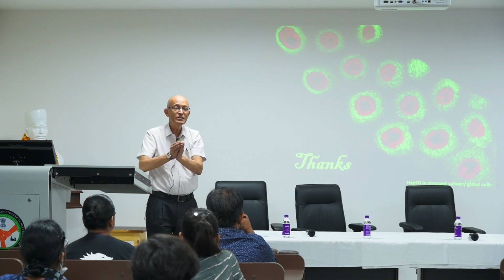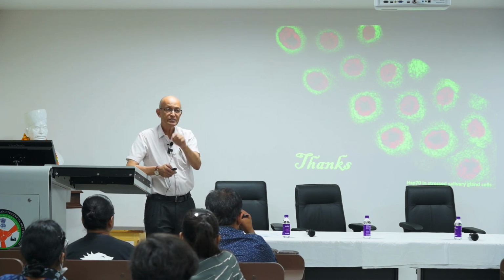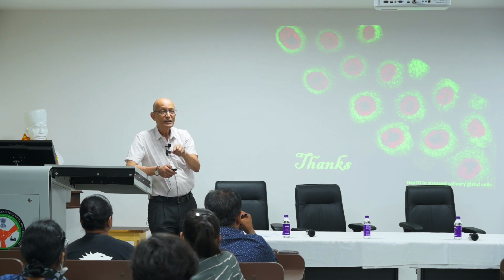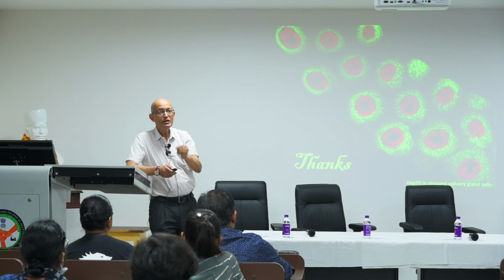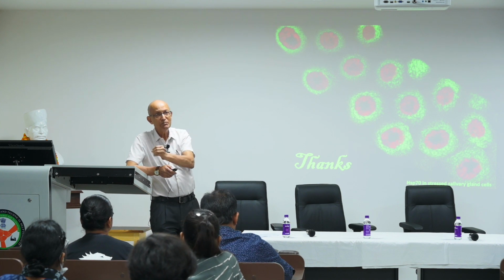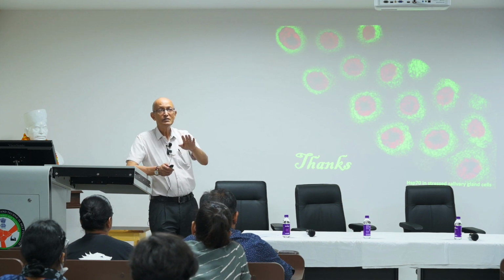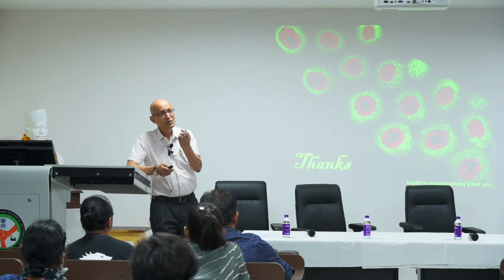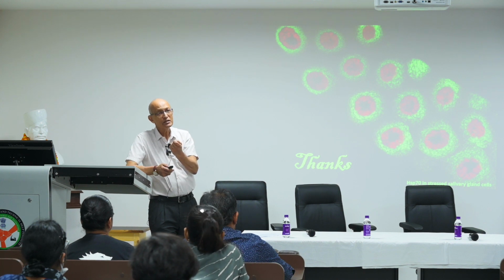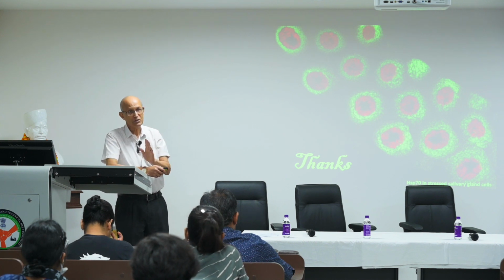What do we mean by focusing? More of the sunlight energy is at one particular point, and that's the point of focus. And the same thing we do in multiphoton: at the point of focus, the probability of two photons hitting the same electron is the highest. So in the rest of the depth, you have less energy and therefore less chance of fluorescence. Only from one point is fluorescence coming, and that's the point of focus. So in this case, you don't need the second pinhole. That's the only case, in multiphoton.